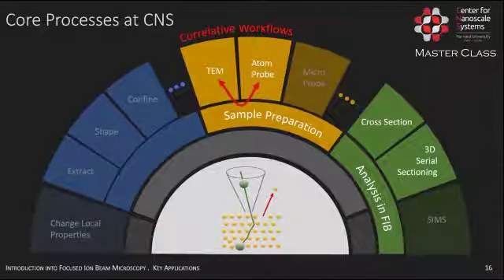Oh yeah, just as a side note, since focused ion beam is used to prepare materials for different techniques, and some of these techniques are accessing similar volumes, we can build up a correlative workflow so that we are not only using each individual technique, but we can actually use the complementary information that two techniques potentially could provide, and therefore further expand our horizon.